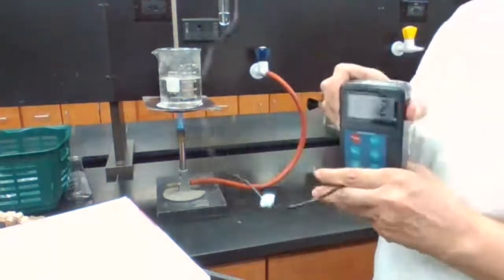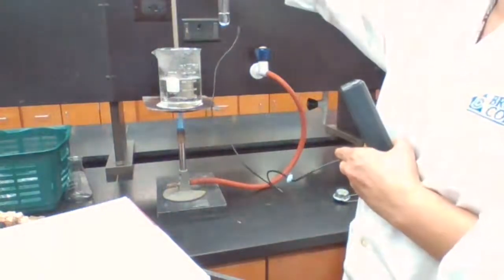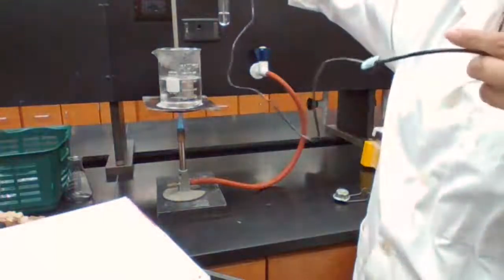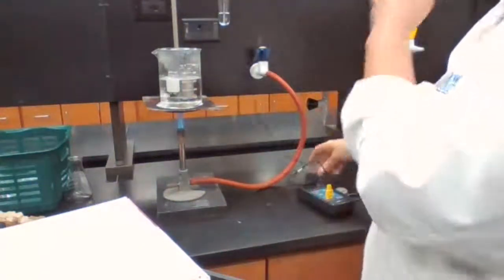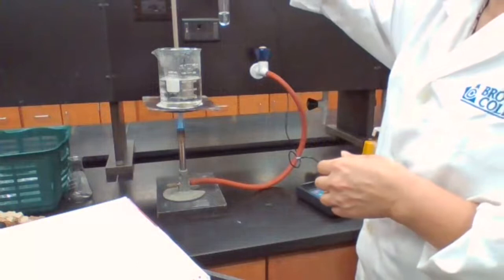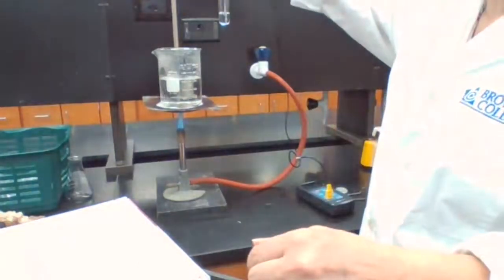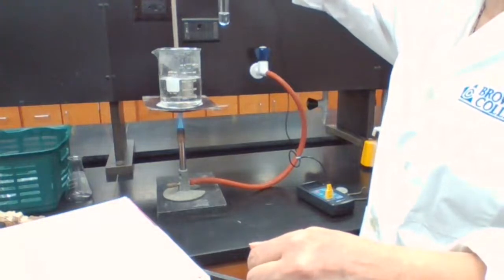52 and still is liquid, so we're just going to be patient and wait until it cools off. Definitely solid at room temperature because we started with solid, so it will freeze before it reaches 25, which is the room temperature.